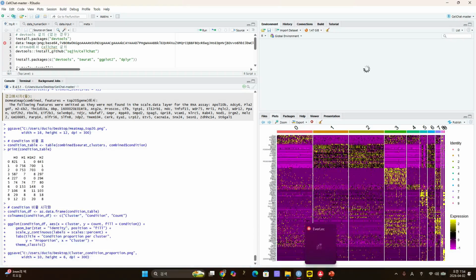And then you can assess whether this clustering is good or bad. If you have some doubt about this, just copy these images.